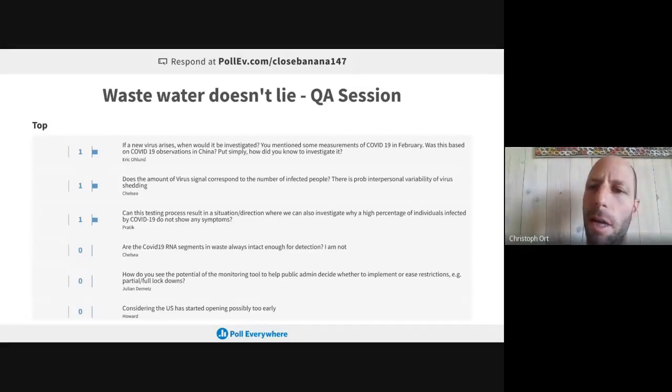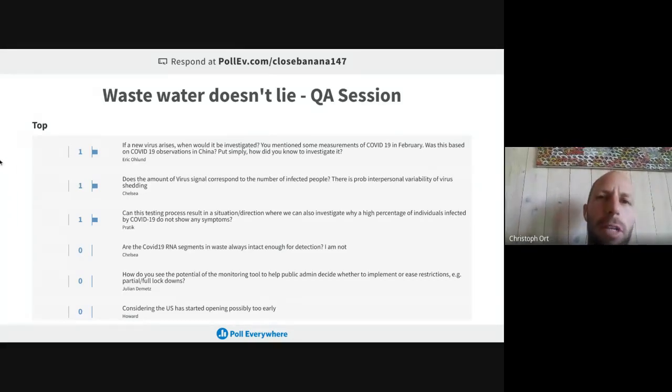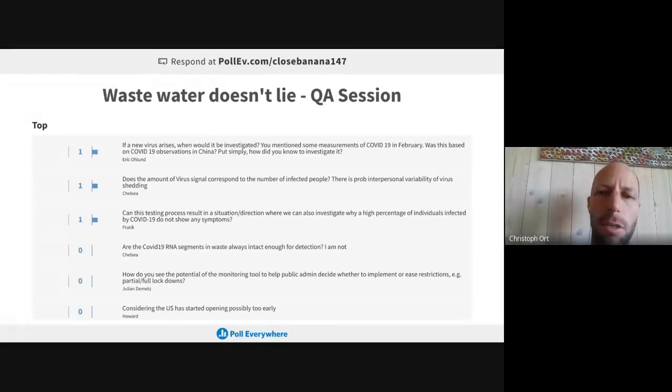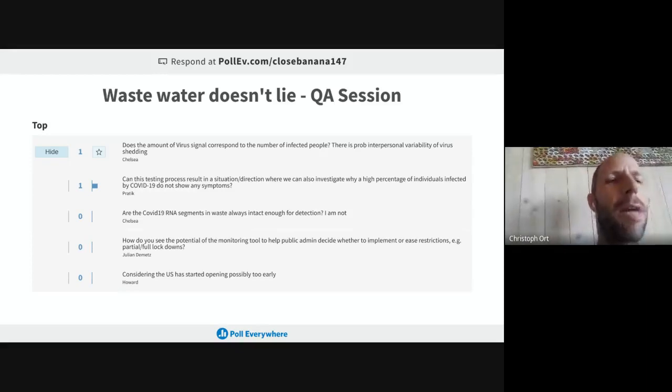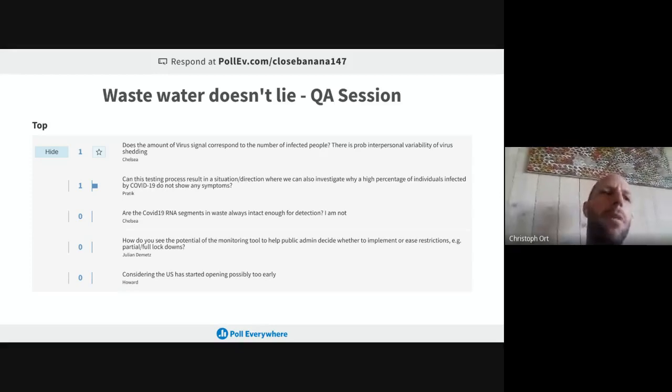And maybe to add, we use the same primers or the same material that is needed for the quantification in the PCR as is done with clinical tests. Obviously, if the genetic information is not available, then we can't do it with wastewater, because then it's not an early warning system, it's just retrospectively following the epidemic curve. But if the tests are available, if the genetic information is available, then we can do this next time, hopefully even more quickly, because then we'd be ready.